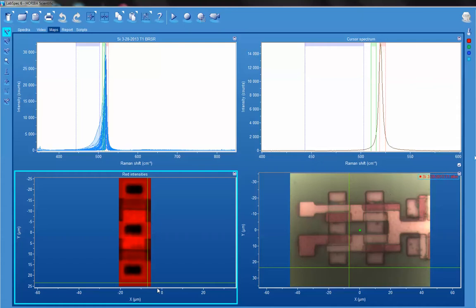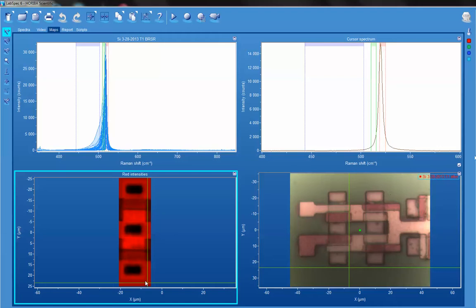By mapping, we generated a Raman image of approximately 15 micrometers wide and 50 micrometers tall. This was using 532 nanometer excitation, moving the stage in 200 nanometer increments, with an integration time of 500 milliseconds. Each spectrum was acquired in 500 milliseconds.